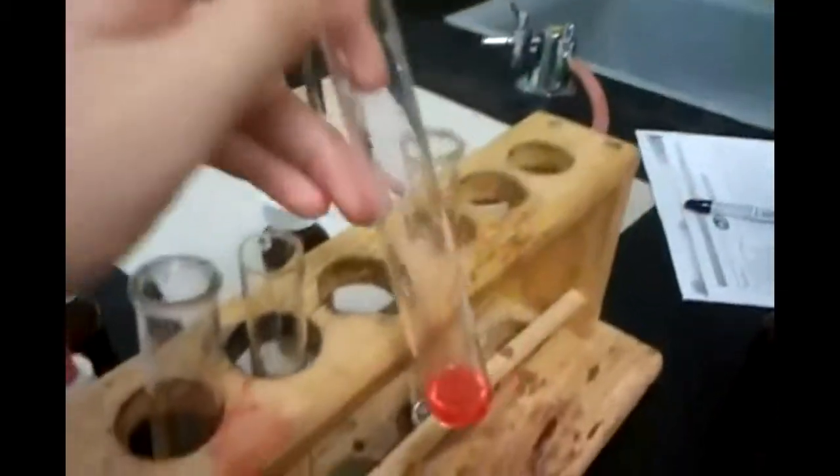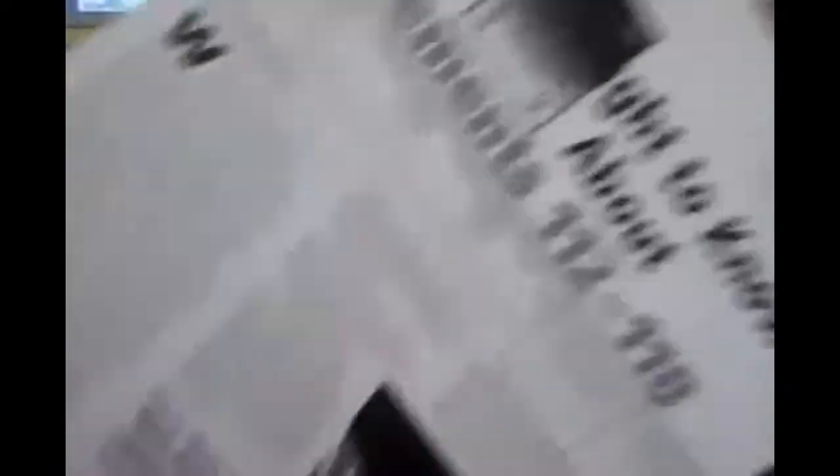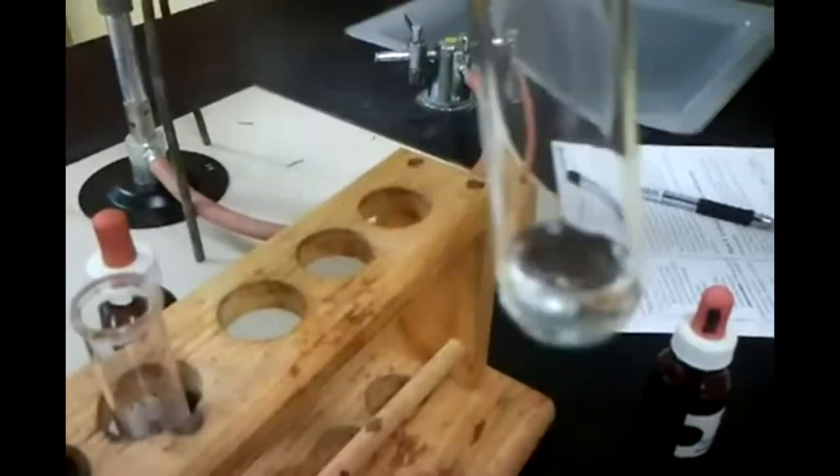There's an article up about elements 112 to 118 — what you need to know, written in a chem magazine but made simplistic. Back to the indicator: for hydrochloric acid it's a slightly more red tone compared to the other ones. And then the last one is sodium hydroxide — it's a base, so the color shall be unknown. Putting in methyl orange — it's just orange.